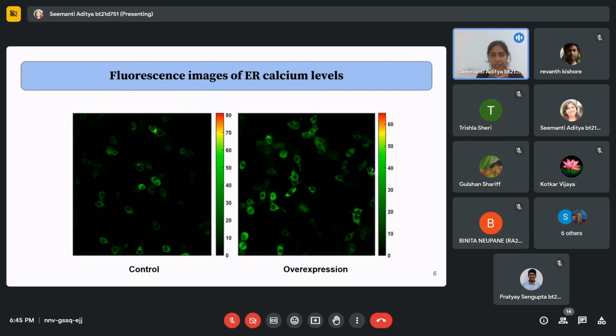Here you can see the inside part of the cell. This is an HEK293T cell, and this is how an HEK293T cell looks under fluorescence microscopy. If you remove the fluorescence, you will just see the outer boundary of the cell in bright field, and you will not see any color. In fluorescence microscopy, you can see the cells like this, and you can see some dotted structures inside it. You will see the nucleus and all of those.